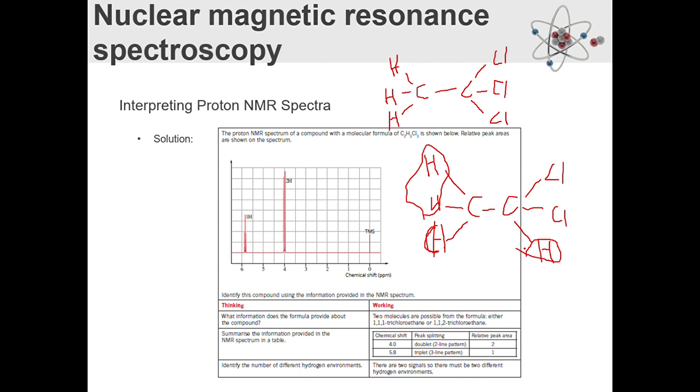Oh look, it might be this one, which has 3 and 0. So it's not that one. You can also tell because there's only 1 hydrogen environment. If it was truly that peak, you would literally just have that and then nothing. Whereas this one's got 2 hydrogens and 1 hydrogen. So you can solve it that way.